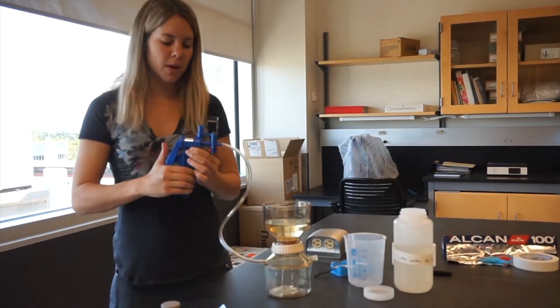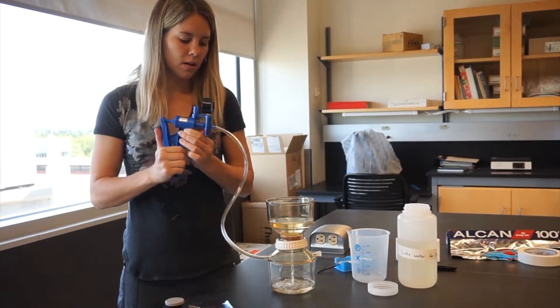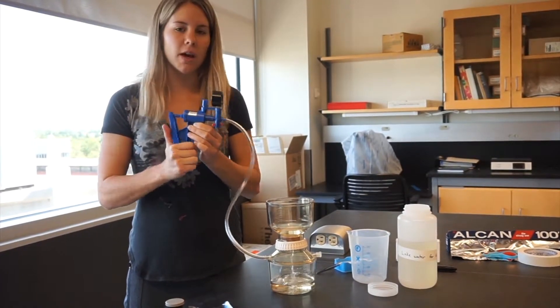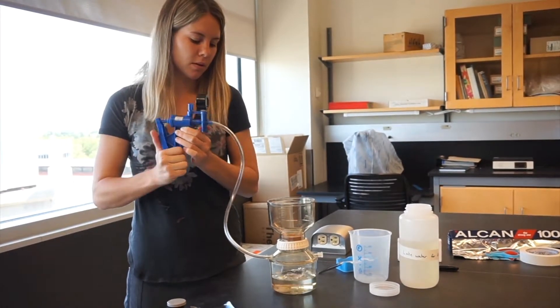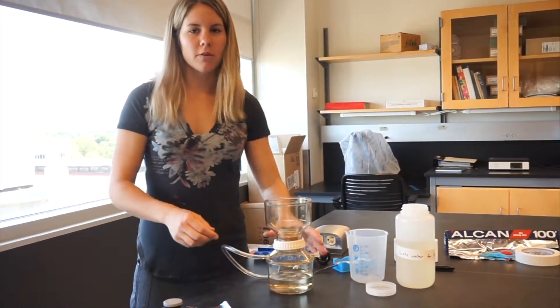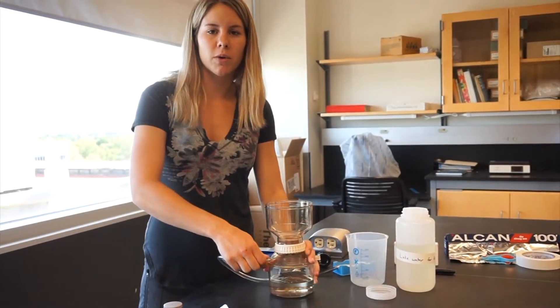Begin hand pumping. As the water goes through, the filter paper should start turning green, and it may get harder to pump depending on the water clarity. Once all of the water is pumped through, you can check the filter paper to make sure that it's an appropriate green colour.